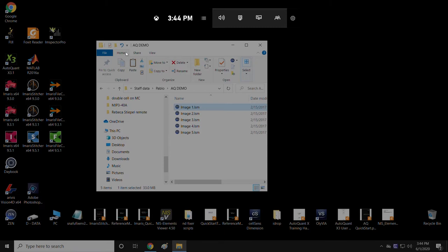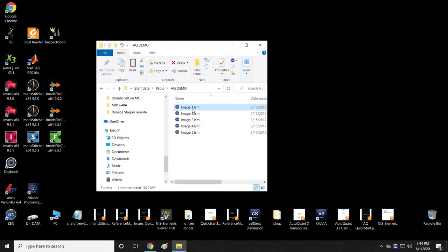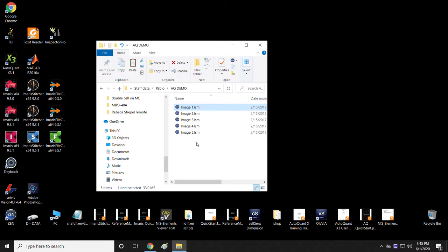The example I'm going to work through are these five images here, which were acquired on our LSM-700 Zeiss confocal microscope. What I'm going to show you is first how to look at and deconvolve one of the images, and then how to do a batch process where we deconvolve many at the same time. The first thing I'm going to do is open AutoQuant by double-clicking on it.